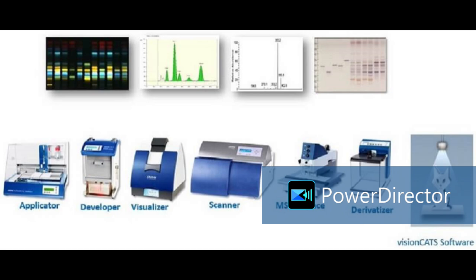Some practical experience is also required. What kind of combo do you recommend for academics like this? Means if you have all the components of the machine, then it will be better. Applicator is a must. Then for development, twin trough chambers are okay. And then photo documentation with visualizer and scanner.